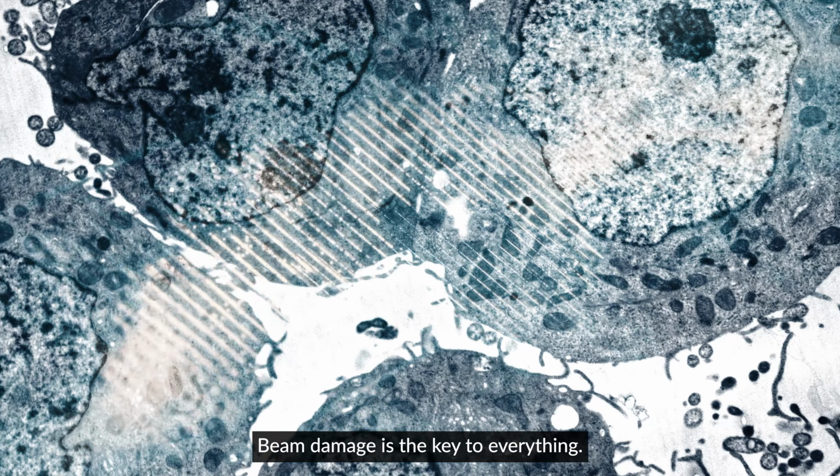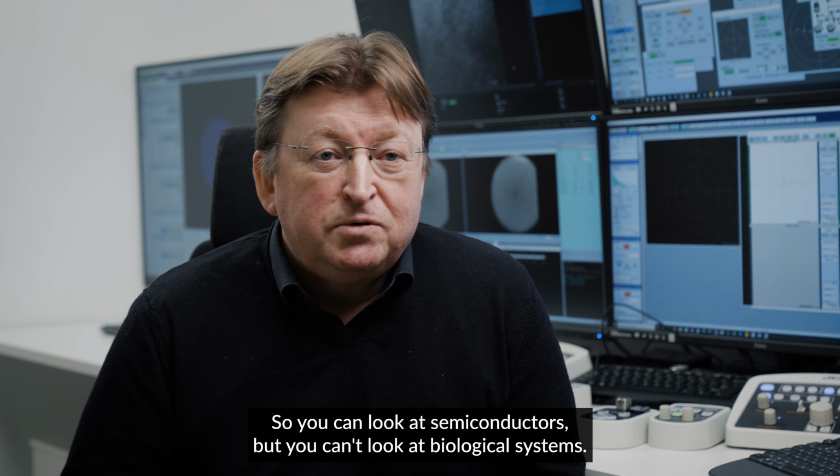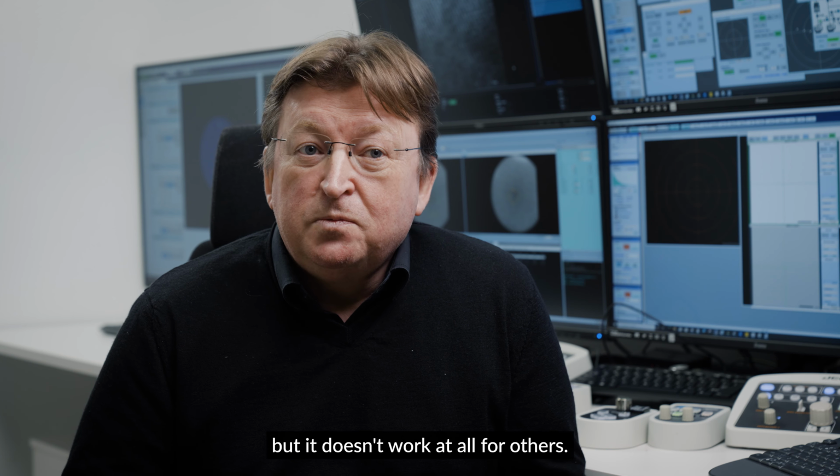Beam damage is the key to everything. There's a limited number of samples that you can look at. So you can look at semiconductors, but you can't look at biological systems. You can't look at organic systems. So microscopy works very well for some things, but it doesn't work at all for others.